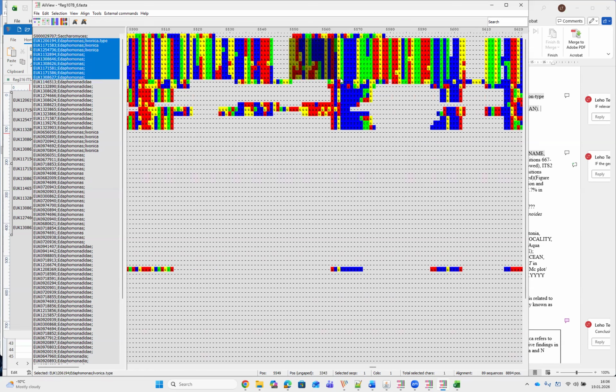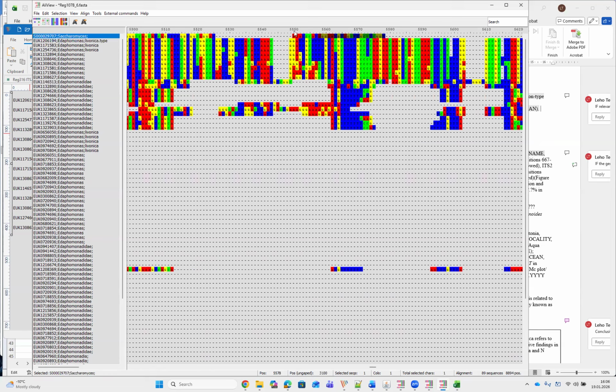So we can take 25 nucleotides for the mini barcode because it's providing good resolution. The Saccharomyces is not very well alignable here, but here we can see some overlap. Not sure about here though. So the exact position in Saccharomyces cannot be very precisely determined.